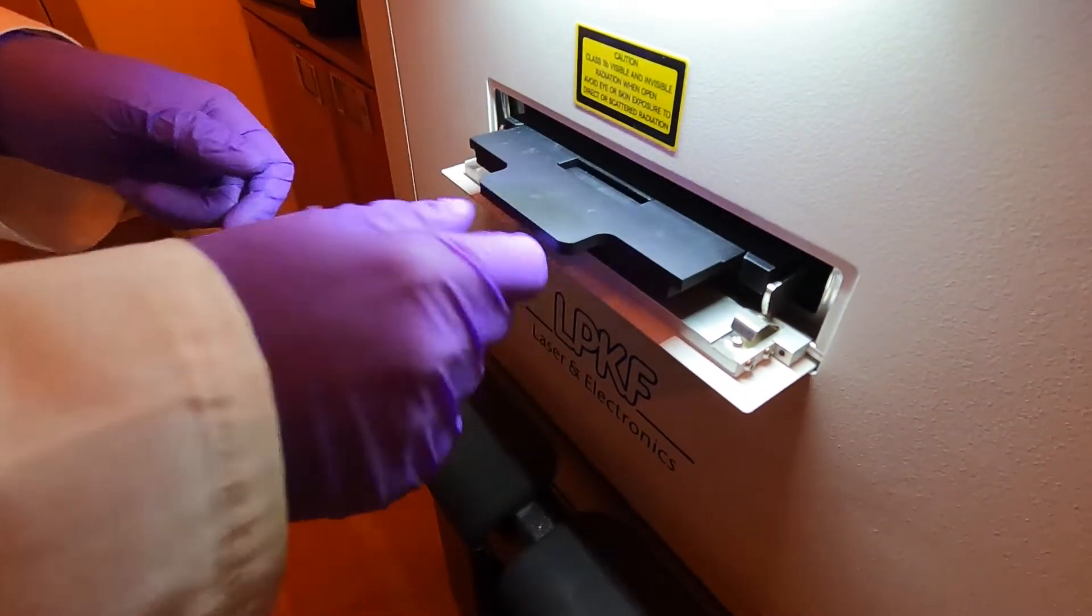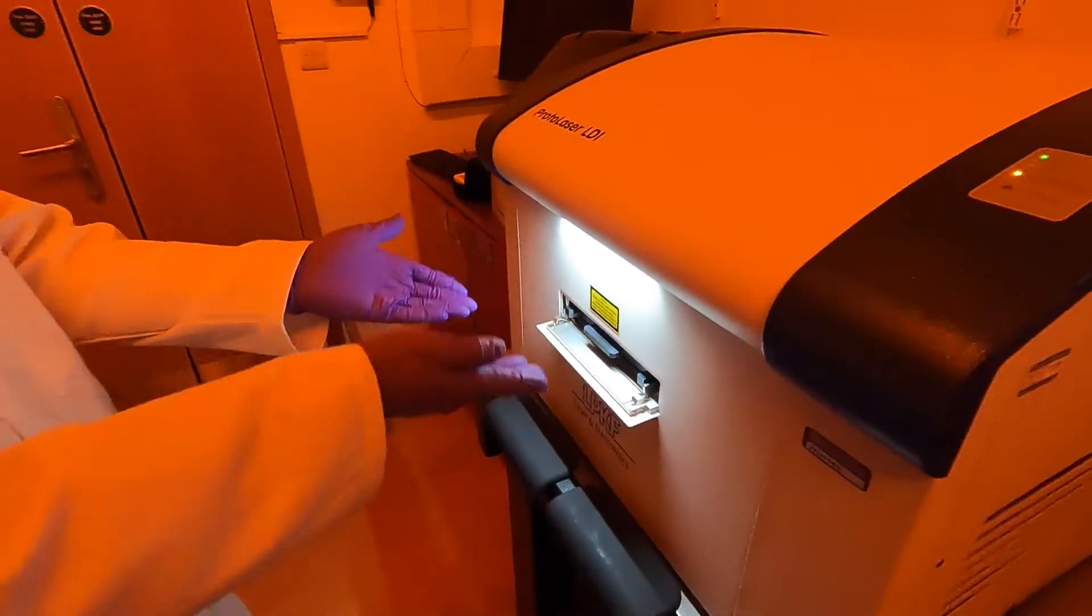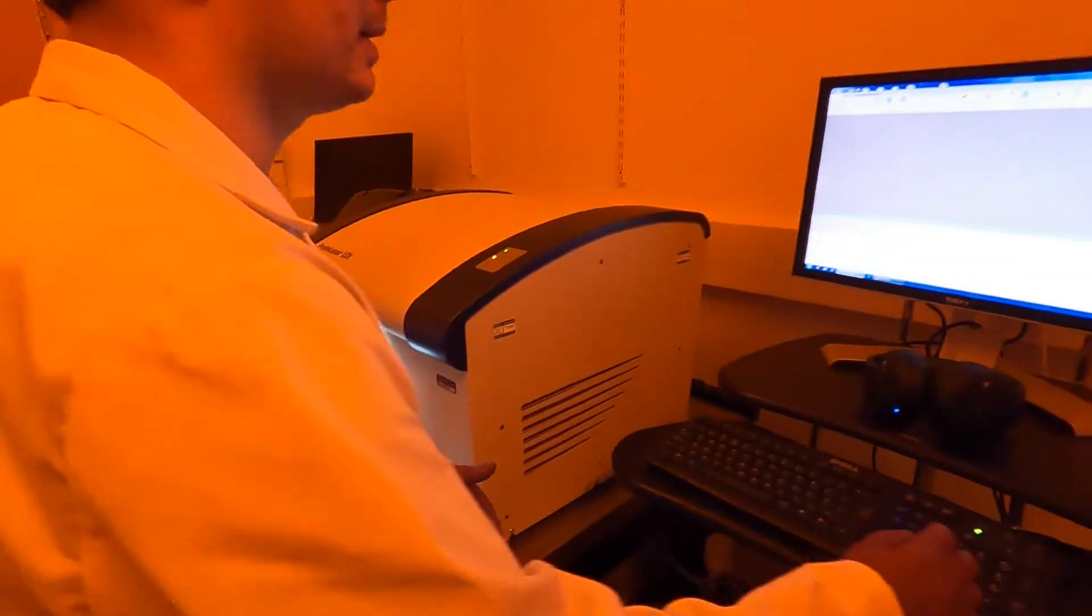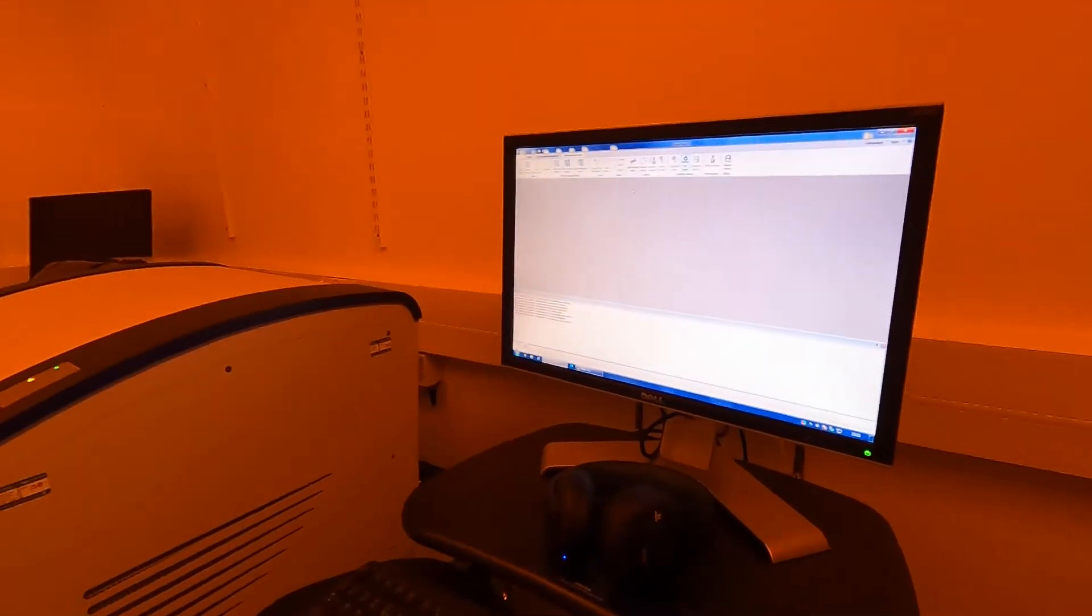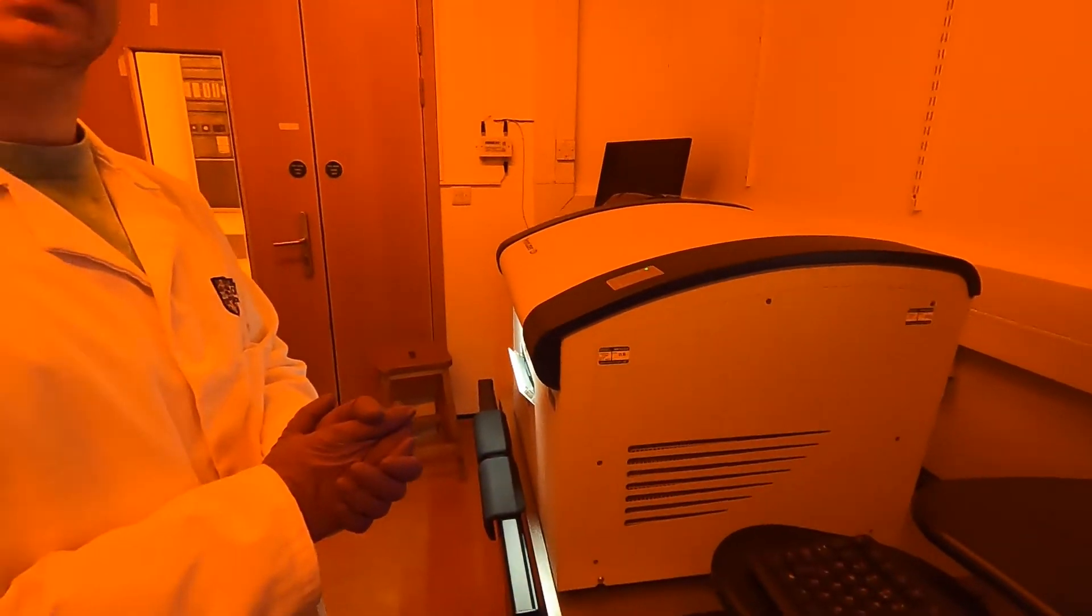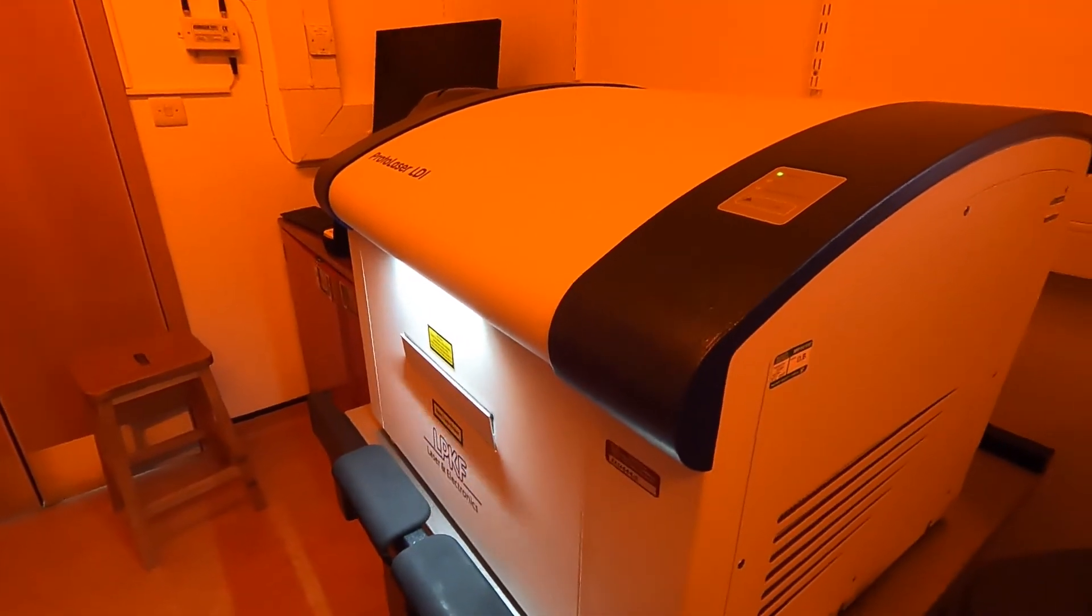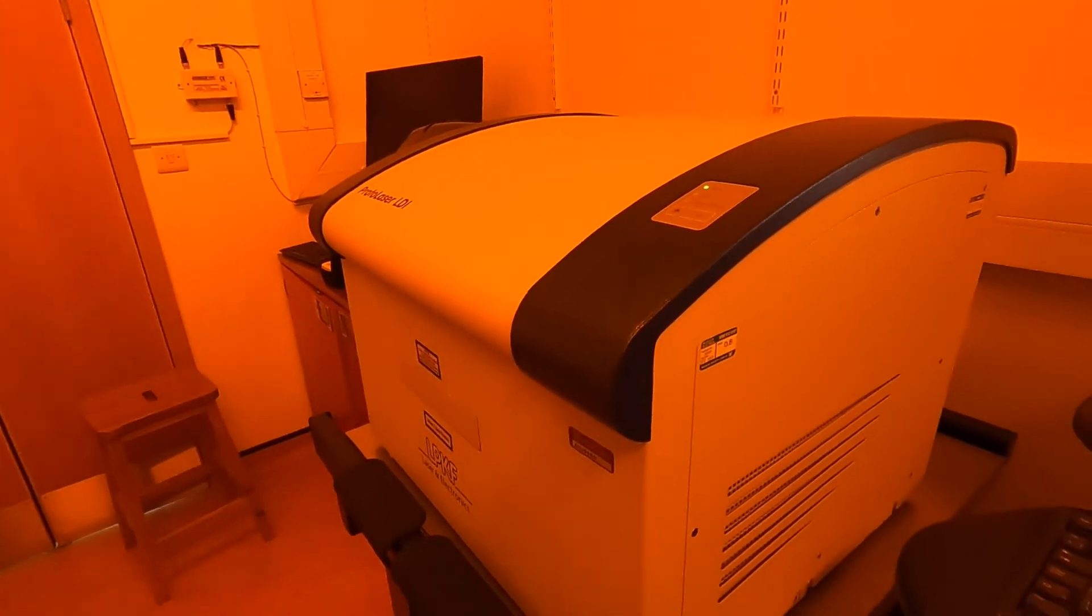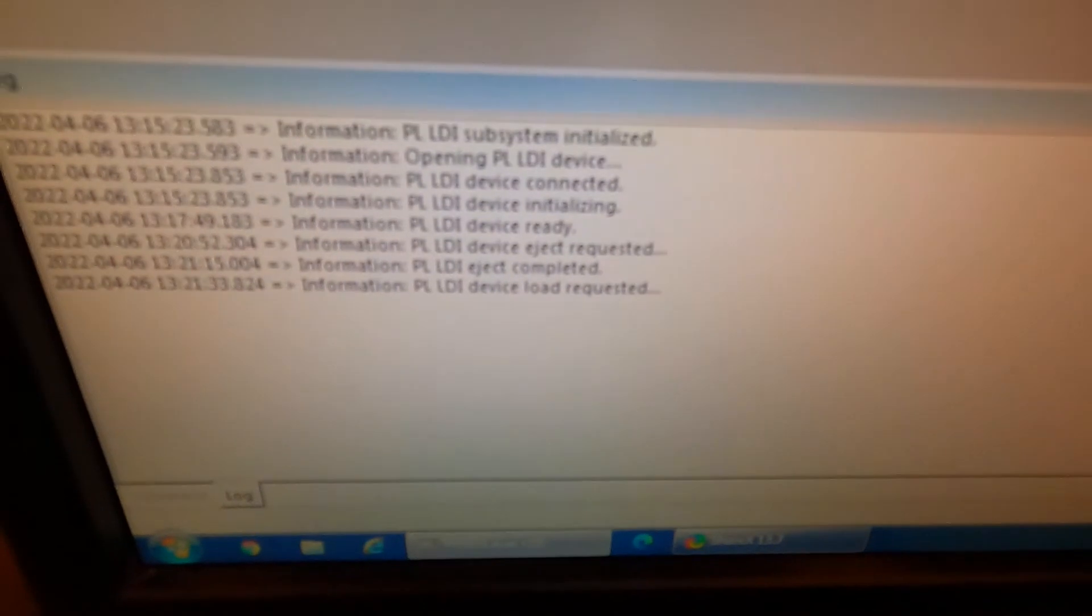You slide it in and as you slide it in at some point you'll hear it click. Once that is in position don't push it up with your hands but rather go back to the software and click the load button and wait for the load to be completed. When the port closes it doesn't mean that the load is actually completed, so you have to check on the software that the instruction appears that the load has been completed.